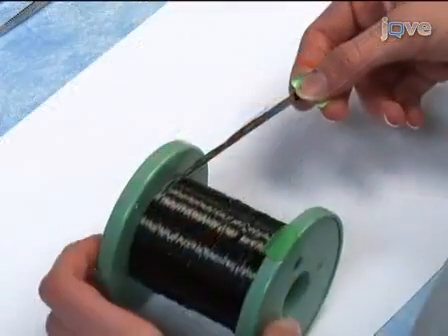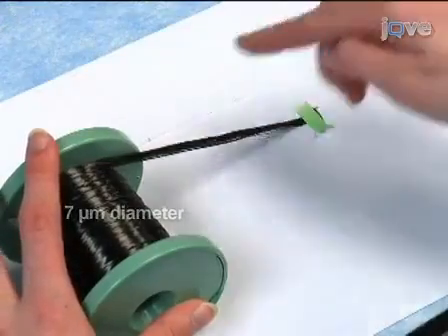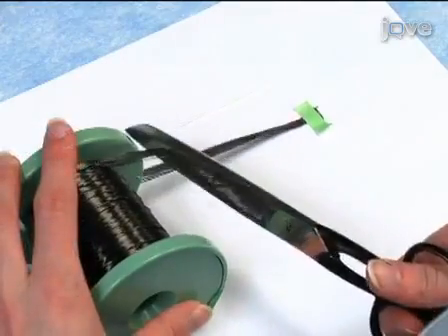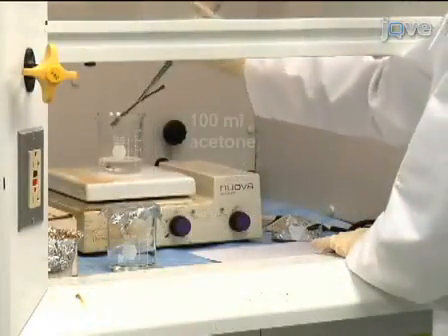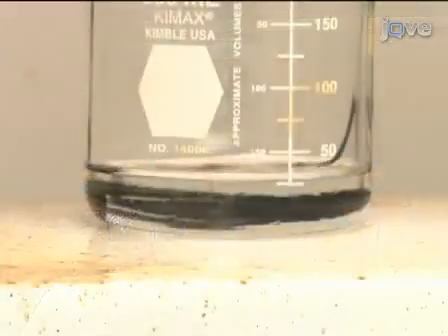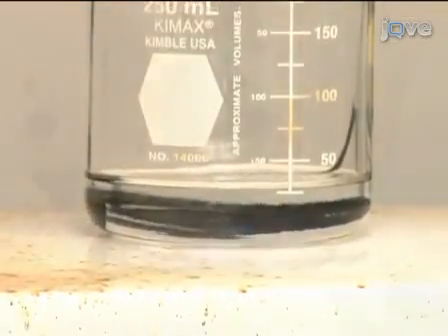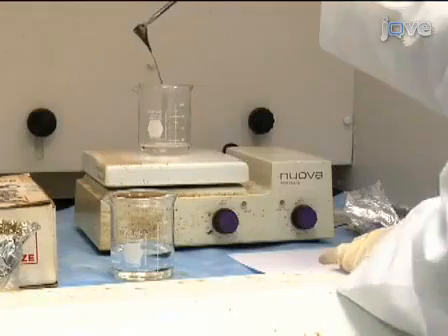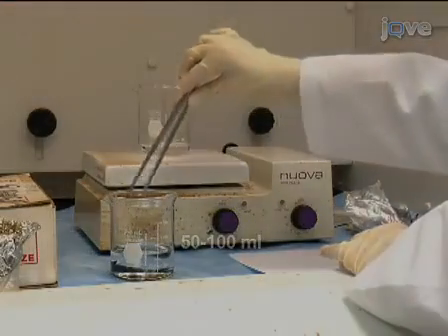To prepare the carbon fibers for making electrodes, first cut a bundle of carbon fibers to a length that is about 1.25 times the length of the capillary pipette. In the fume hood, remove the sizing by boiling about 100 milliliters of acetone in a container and adding the fibers to the hot boiling acetone for 30 minutes or longer. After boiling, remove the fibers from the heated acetone and transfer them to a clean beaker containing 50 to 100 milliliters of fresh acetone.